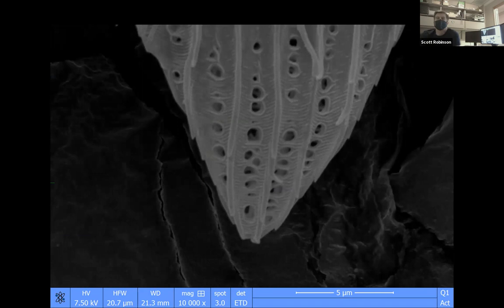Bugscope is something that we started in 1998. I got hired to come in here. The microscope was installed in December 1998. I got here in November 1998. We installed a different microscope. This is a newer one.